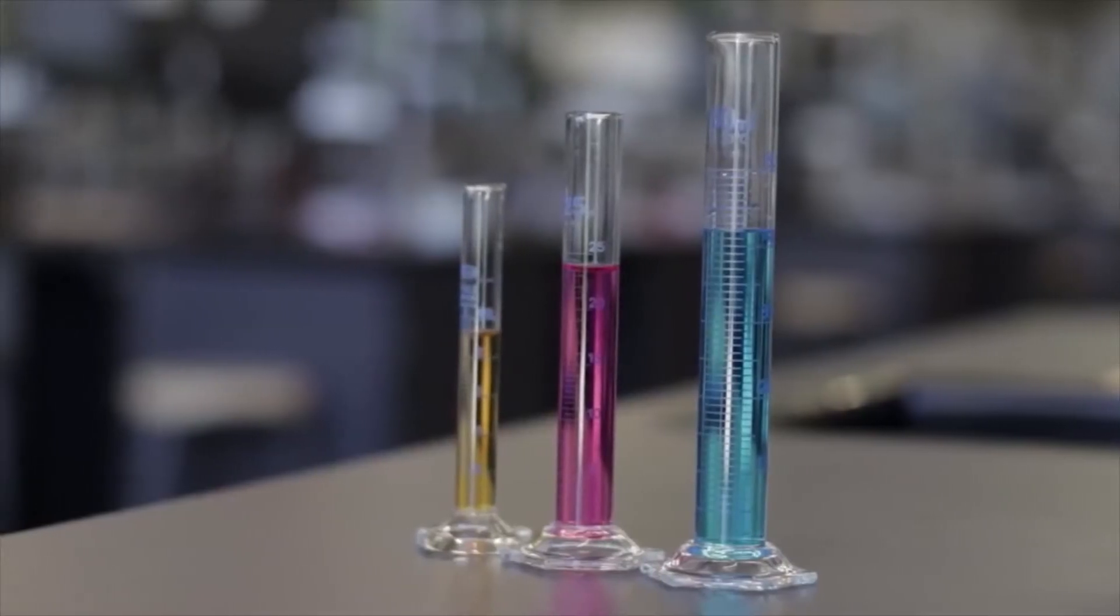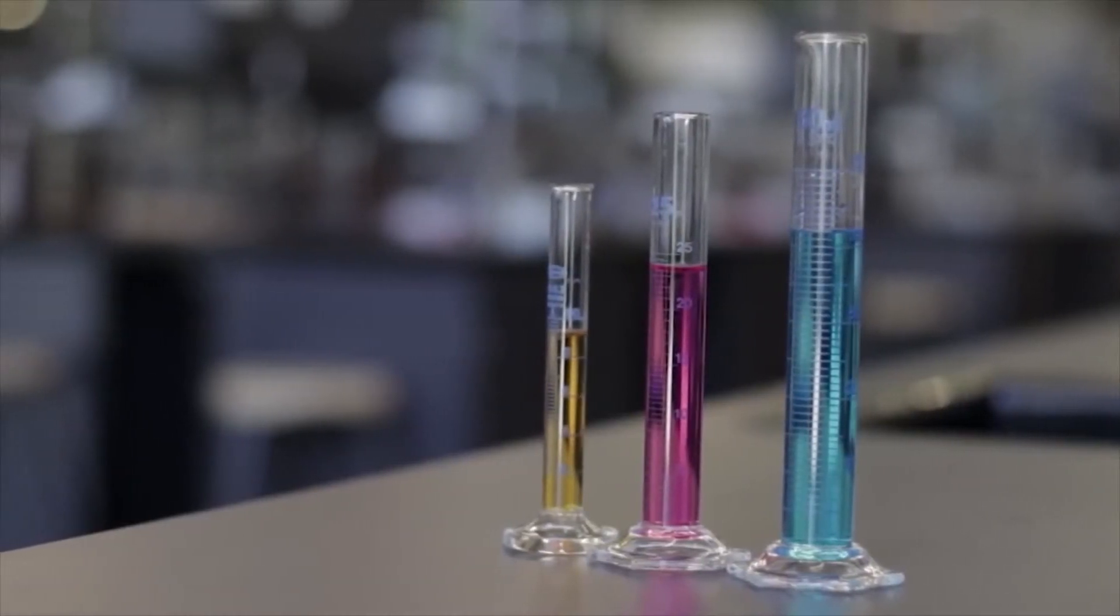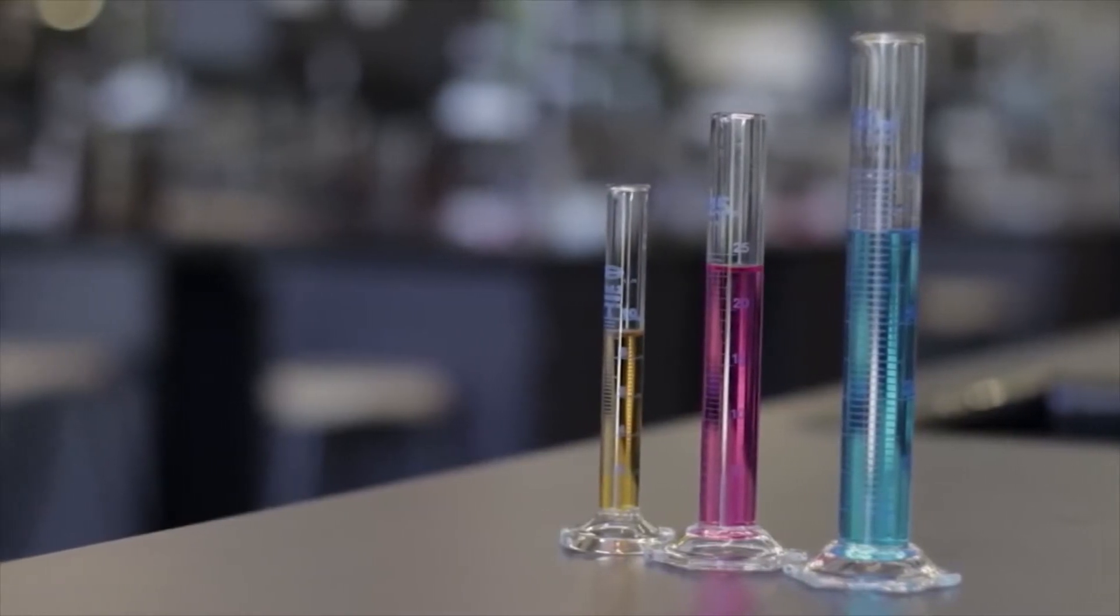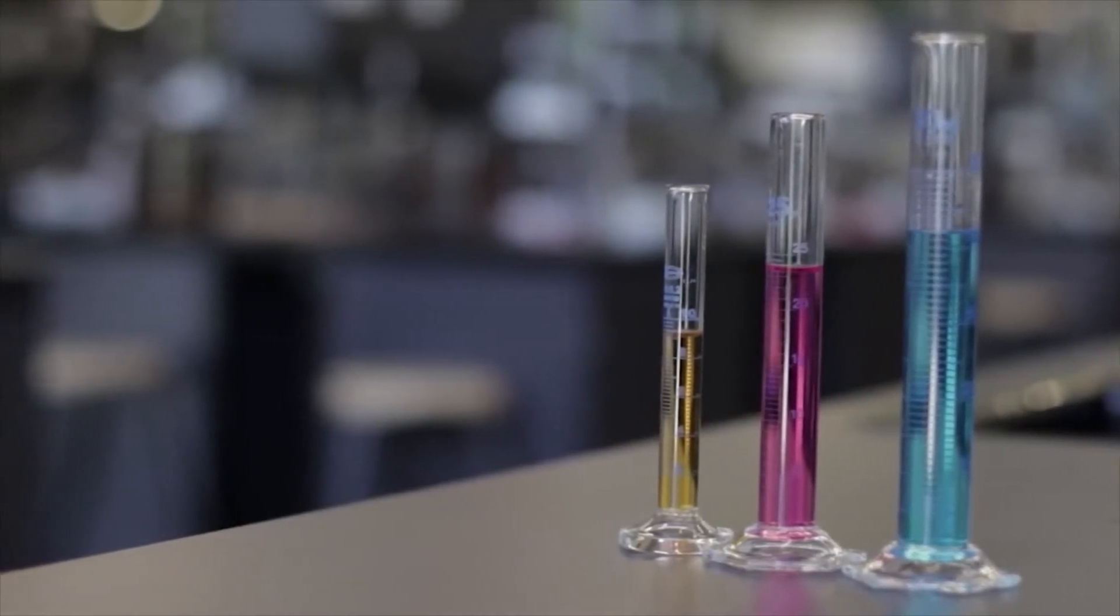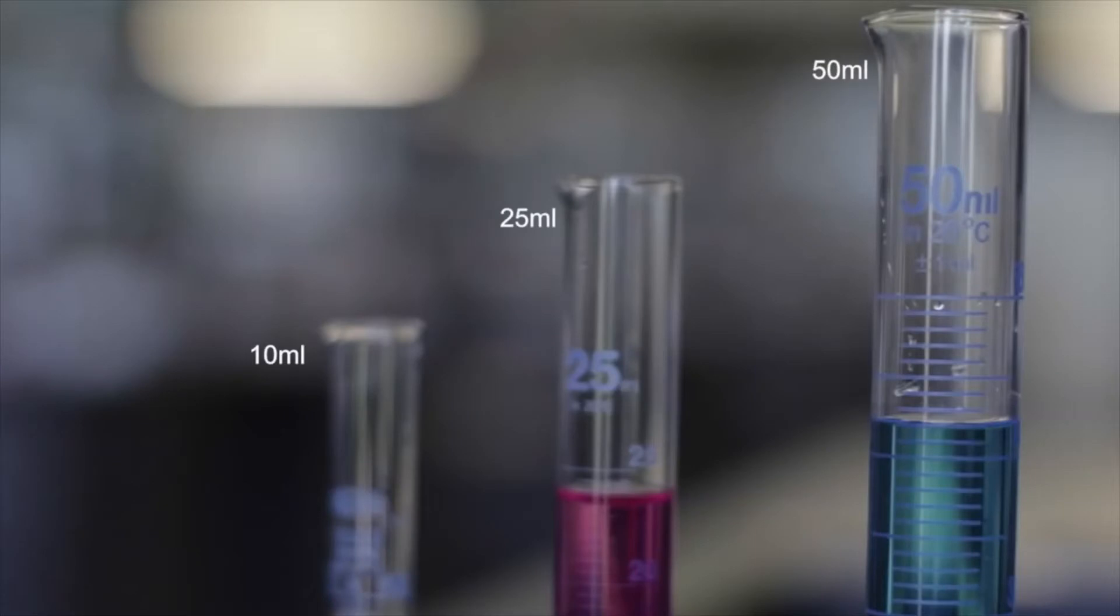A measuring cylinder is used to measure a certain volume of liquid, but is not as precise as a pipette or burette. It is found in different volumes. The volume of the measuring cylinder is found here.